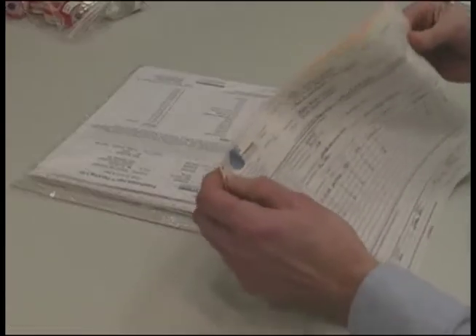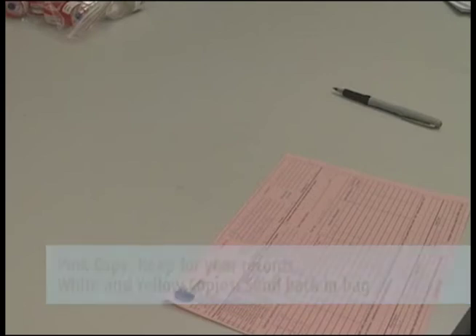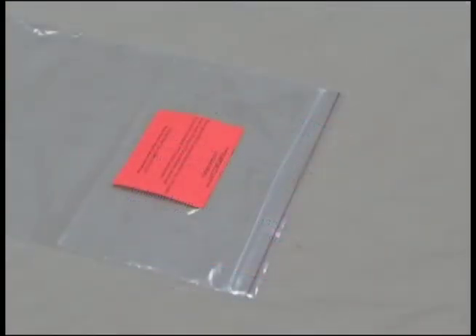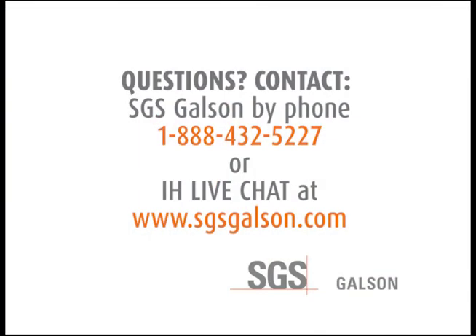Then complete the chain of custody form. It is important that you include all the information requested in order to ensure the turnaround time of your samples. Remove the pink copy and keep this for your records. Send the white and yellow copies in with the samples to the lab in the large Ziploc bag. Please place any unused media inside the Ziploc bag marked with the orange unused media label — this will indicate that these items should not be analyzed and will be properly disposed of by Galson Laboratories.